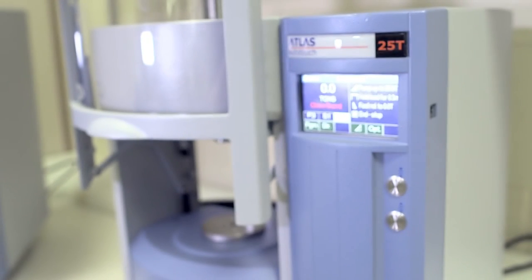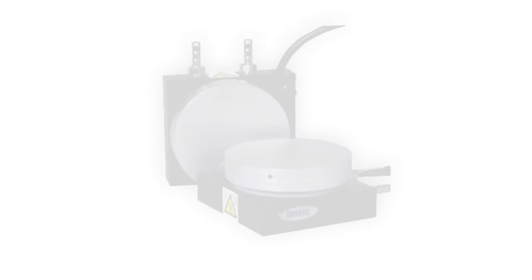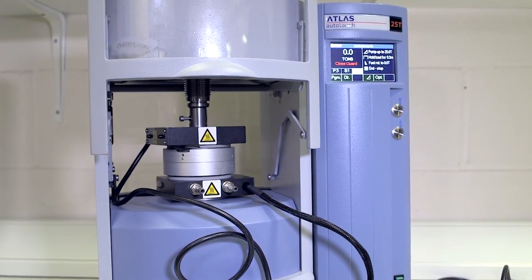The Autotouch presses, which traditionally are used for XRF analysis at companies like cement companies, are also compatible with the rest of our sample preparation products, such as our filmmaker kits and our heated platens. The heated platens, for example, can be heated up to 300 degrees and can be used with all of our Autotouch presses other than the 40 tonne press.